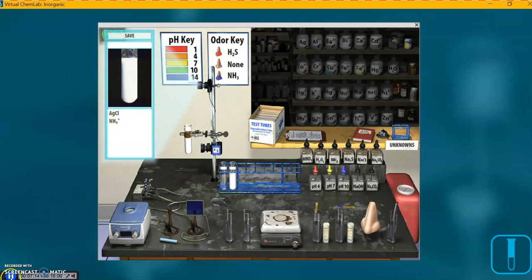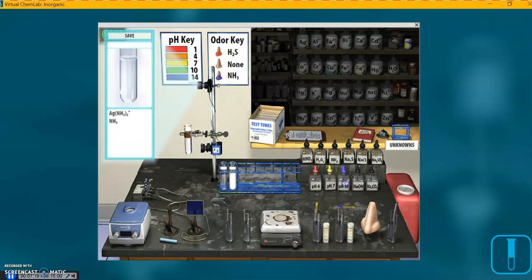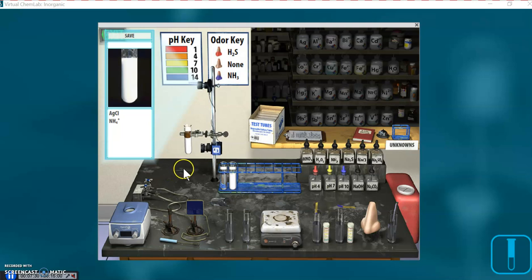We could actually go back and forth with this. I could click on the pH 10 here, making it soluble. Back to the pH 4, insoluble. 10, 4. So we've demonstrated the presence of the silver ion. And we're ready to move on to the next step, which is the practice unknown.